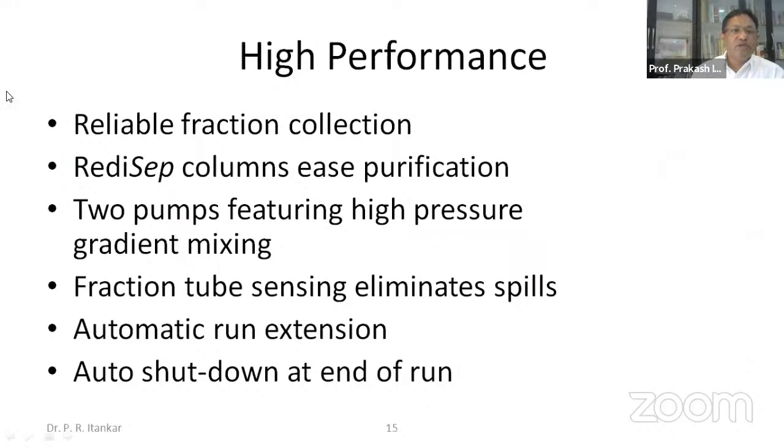Now, high performance here means reliable fraction collection. What is really needed is to identify where to change the fraction. If your machine is taking the solvents in a desired gradient, passing them through your sample and the column, and certain constituents are getting separated, how are you going to know which fraction has which constituents?